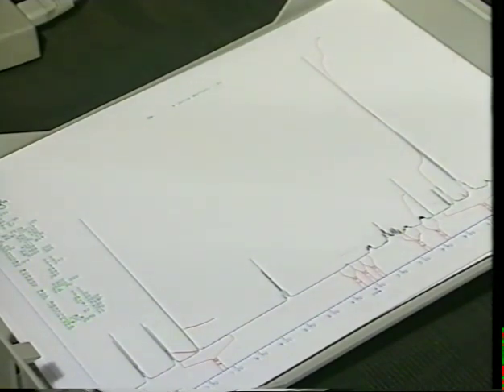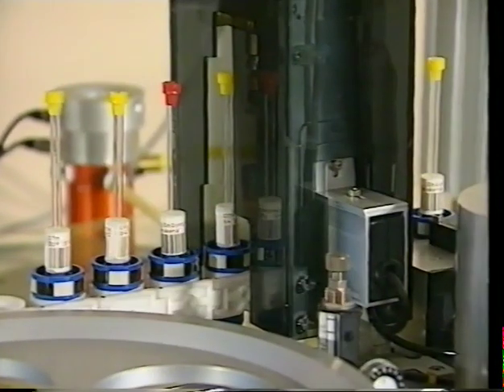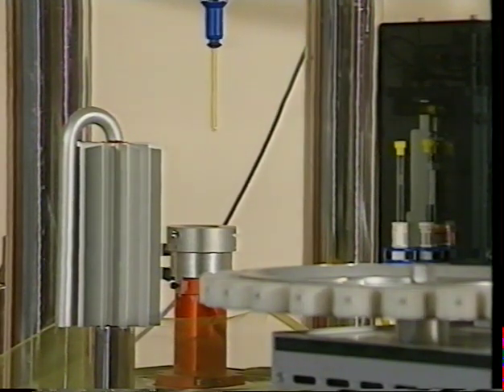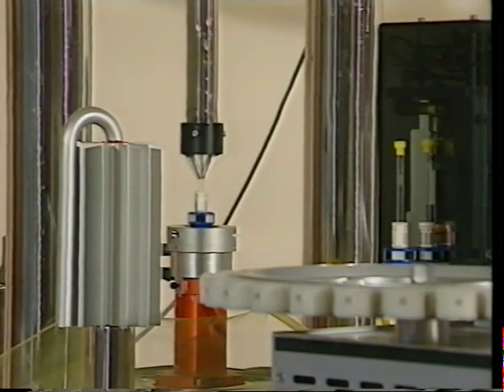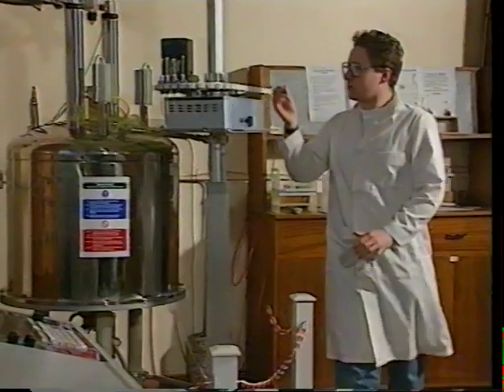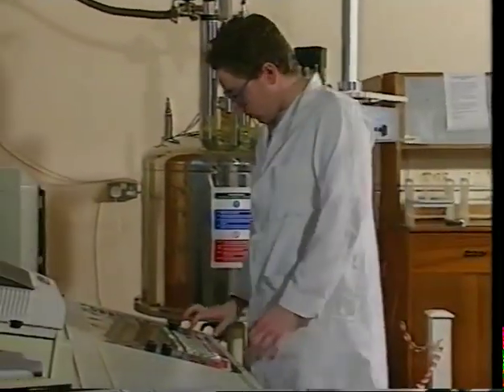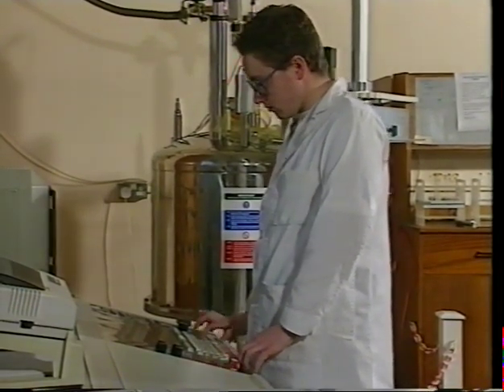In this program, we have dealt solely with proton NMR, but the basic principles described are commonly applied to detect other nuclei such as carbon-13, nitrogen-15, fluorine-19, and phosphorus-31. The detailed information provided by NMR spectroscopy has become an essential tool in the chemistry lab, enabling chemists to confirm that the molecule produced is exactly what is required.